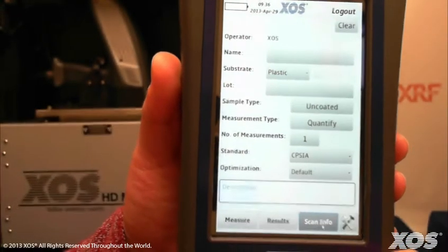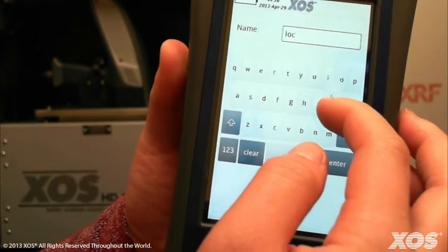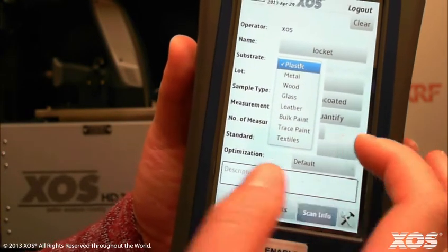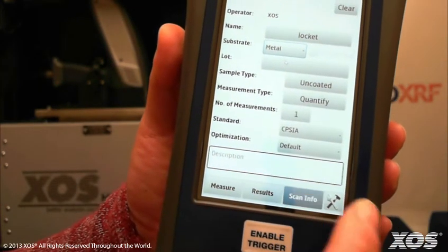Enter sample information using the scan info tab. First, name the sample. Then choose the substrate material — you have eight different substrates to choose from. For this sample, we'll select metal. You can enter lot information or a description if necessary.